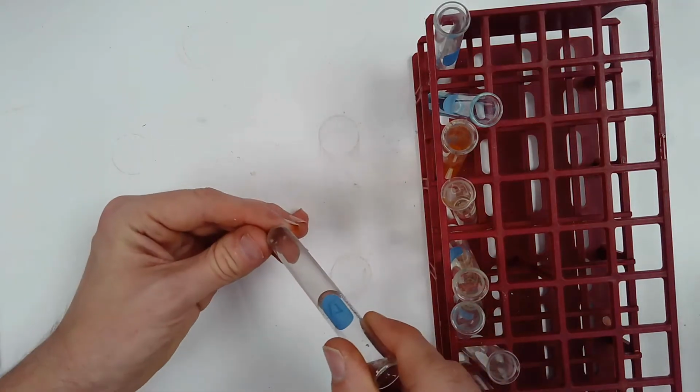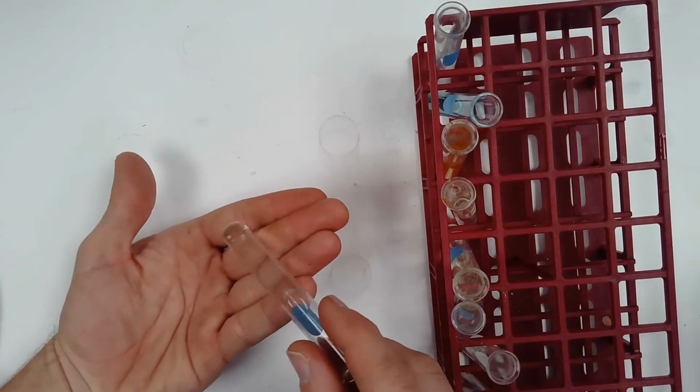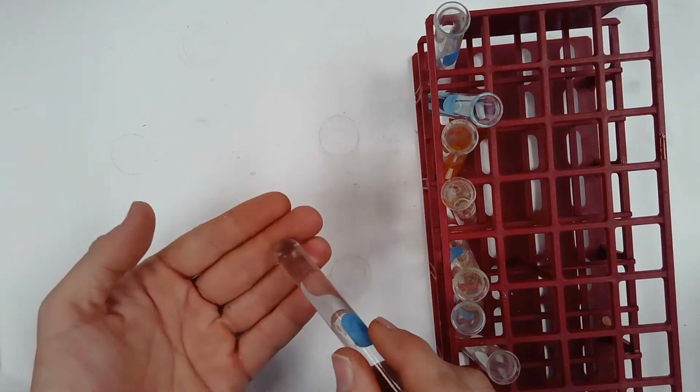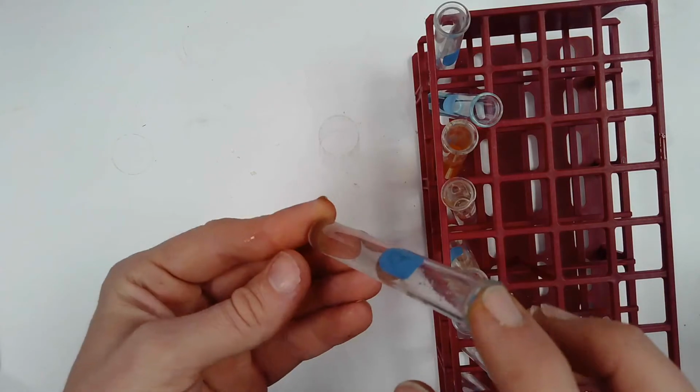All right, so it's kind of hard to believe, but this liquid here that's really transparent, right? You can see my hands through it. It just looks clear. It contains precious metals. It contains silver. Right here, this is probably well north of $1 worth of solution.